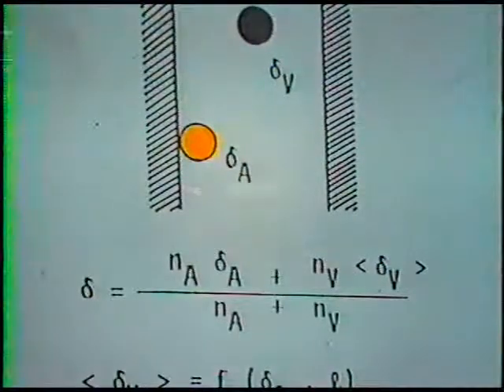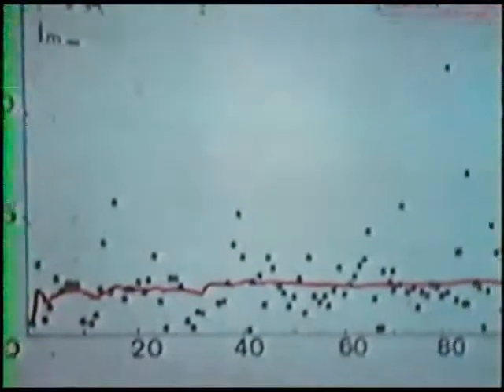And it has been possible to determine the distance between two successive collisions, and after each collision to determine the average distance for all these previous collisions. And when this average distance is constant, it is the mean free path imposed by the structure. It is exactly the equivalent of the mean free path in the gas phase, except that here it is imposed by the structure. For example, this is the case of the mordenite channel.